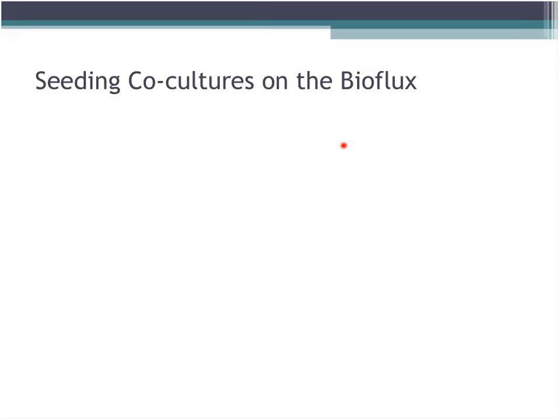And I would seed these cells in at about 10 million cells per mil. So really, really high concentrations. And I would do this first thing in the morning usually. So put these cells in at really high concentrations, give them a chance to attach to the plate and spread out into what should be a beautiful confluent monolayer by lunchtime. So about a 4-hour incubation period for that.